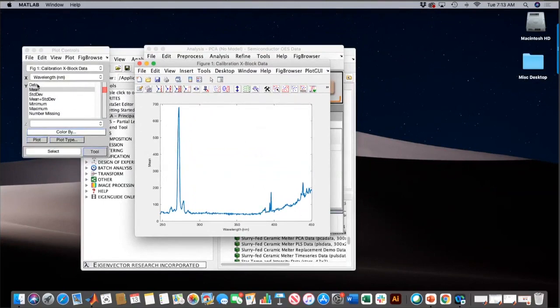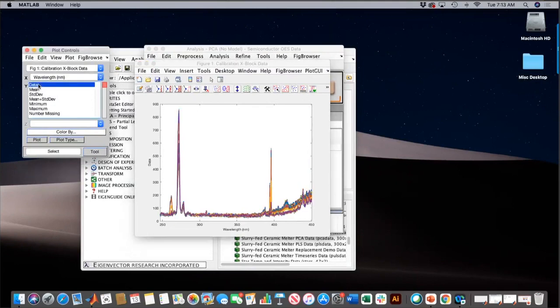And that comes up. And so here's my average spectrum in the OES for this. And I could click here on data in my plot controls window, my plot GUI window. And this is all the data that I have here. And again, I think this is 46 steps, something like that, of data. And I can look at this in various ways in plot control, but I started it this way specifically so I can show this. I've got the data here. It's up in plot controls.